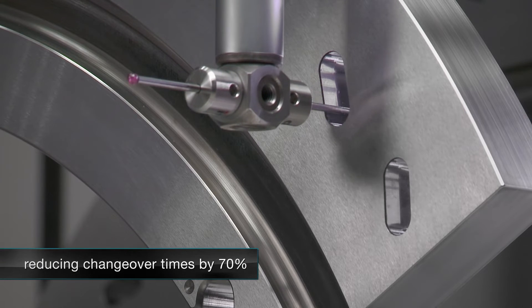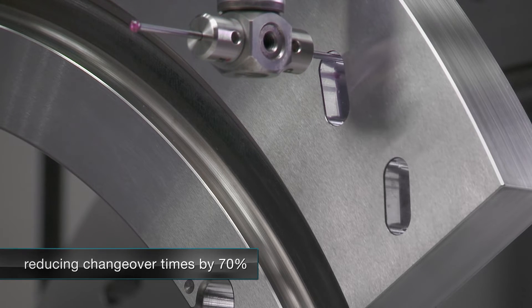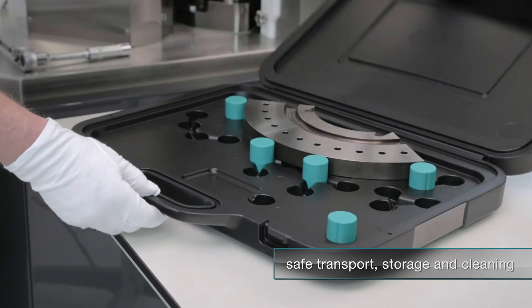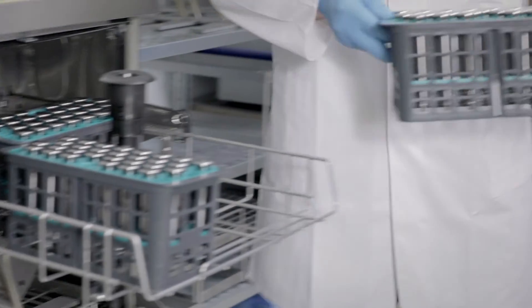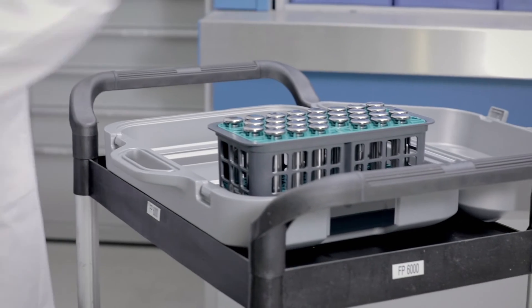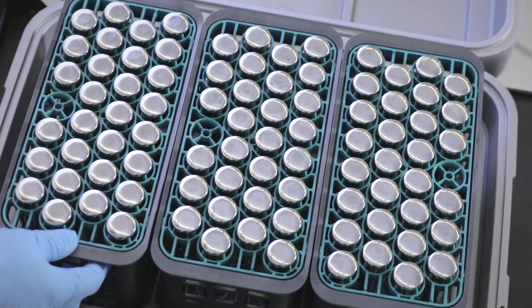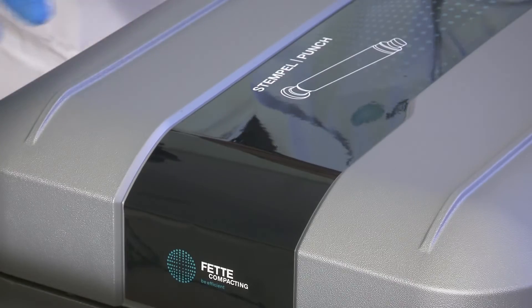We also offer solutions around the tableting tools. An example of this is the user-friendly Try Easy case system, so that the tools can be safely transported, stored, and cleaned at any time.